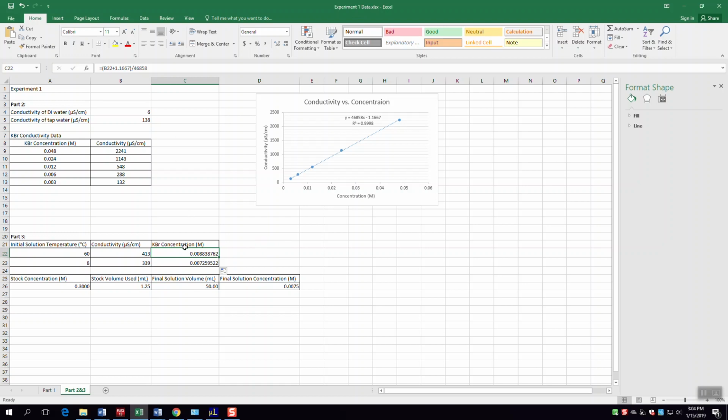So this shows that it's very important that we use a common temperature of water, in this case room temperature water, which is what we usually use because it's commonly available, in order to make all of our solutions. Now you'd have to really go out of your way to use 60 degree or 8 degree water, to put it in an ice bath or to heat it up on a hot plate. However, we're here just demonstrating the concept and allowing you to use the concentration curve and interpret the data that you get from there. In the next section, Tim will talk about the outline that you are expected to hand in when you leave lab the first day, and some of it should be done before you come to lab.